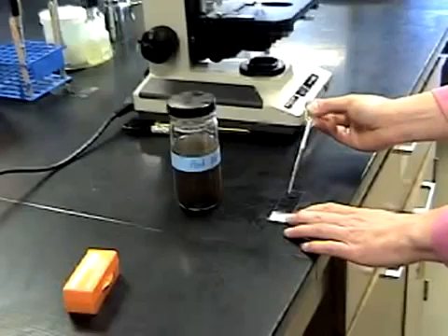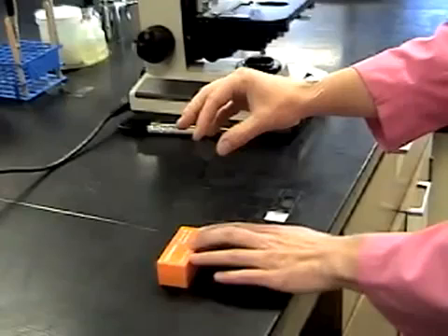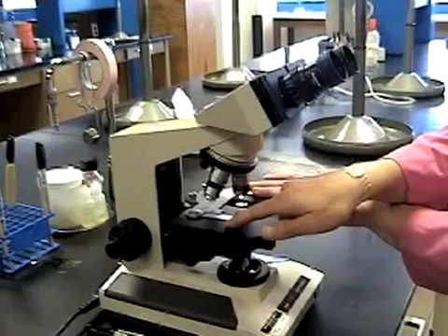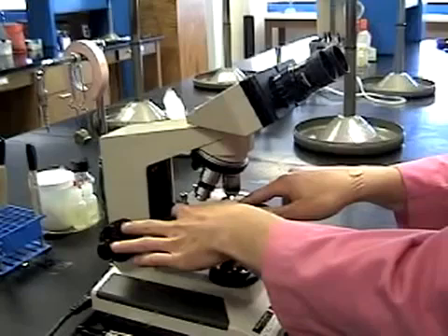Now take a drop of pond water from the bottom of the jar — there should be a lot of really great things to see there. Place the drop of pond water on your slide. We'll be covering the pond water with a cover slip. When you place your cover slip onto the water, do it at an angle so that all the bubbles that would form will be forced out to one side of the cover slip.